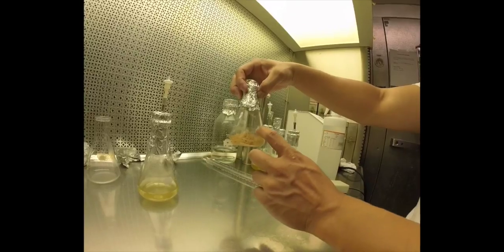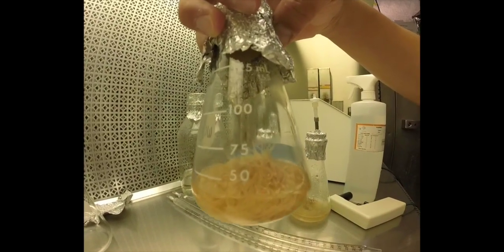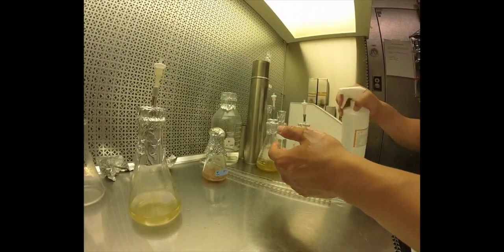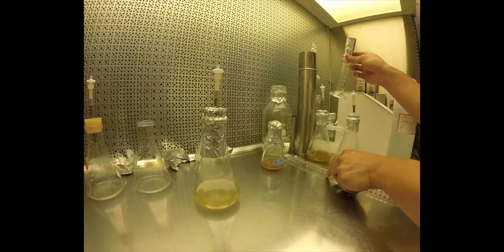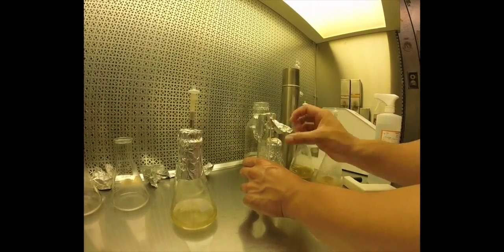So put this to the side, and we can use these roots. The hairiness on the actual root tips there is a marker of generally good health. So we'll try to get a few of those into this flask here. So I use 50 mils of B5 in this co-culture.